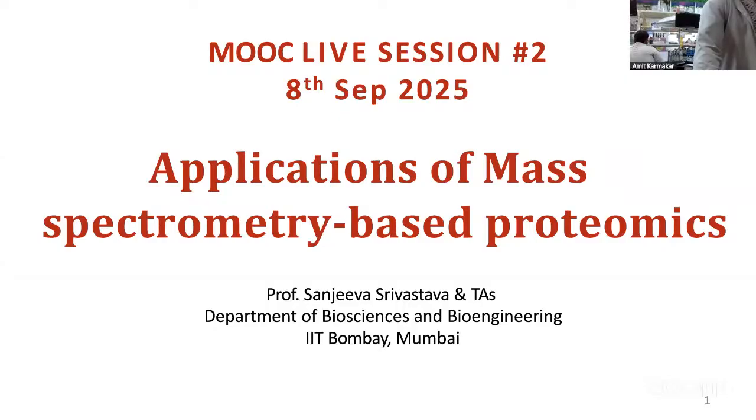Today, we are going to talk about a very exciting technology, mass spectrometry, which has become the major workhorse for proteomic applications. As you've already been studying in your course, mass spec has revolutionized our ability to look at the complex proteome, its protein identification and quantification, to a scale which was not possible earlier.